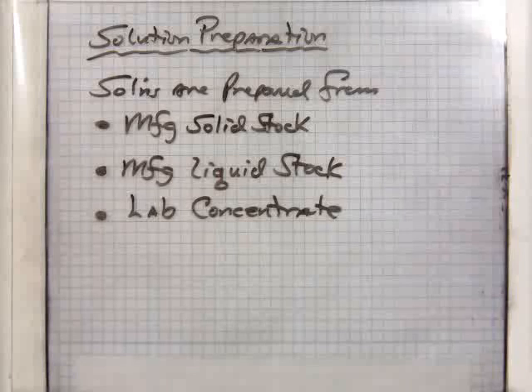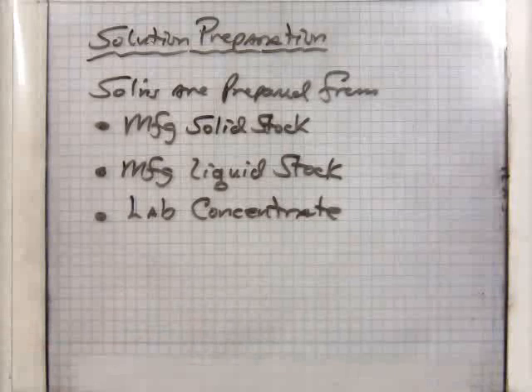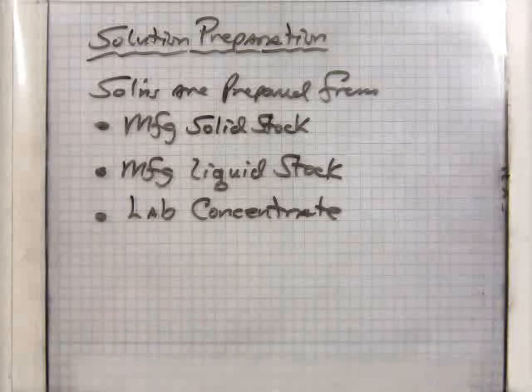The essence of preparing a solution is quite simple as far as procedures go. In essence, what you're doing is adding a solute to a mixing container and diluting up to but not to exceed a desired volume.